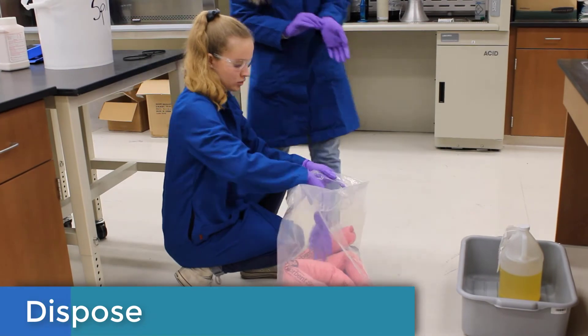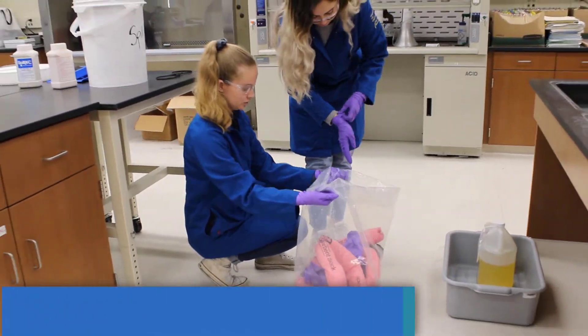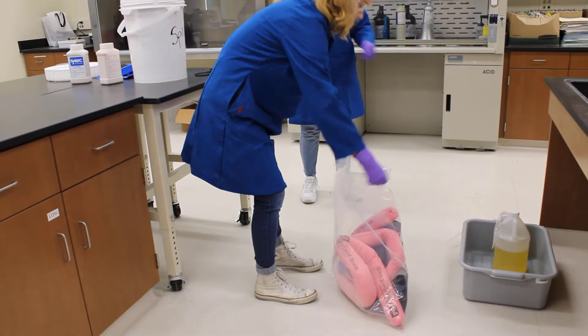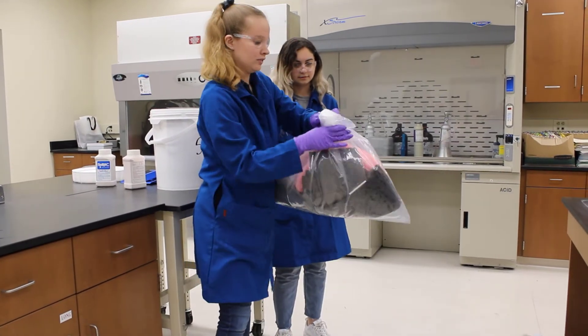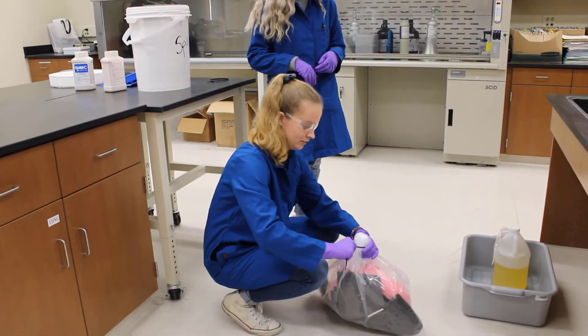Dispose of the cleaning materials in the bag with the other items, or put them in their own bag. Don't forget to include your disposable PPE such as gloves at the end of the cleanup. When you are ready, roll up the edge of the plastic bag, securing the top, and twist it to close the bag opening. Fold the bag onto itself and secure tightly with a zip tie.